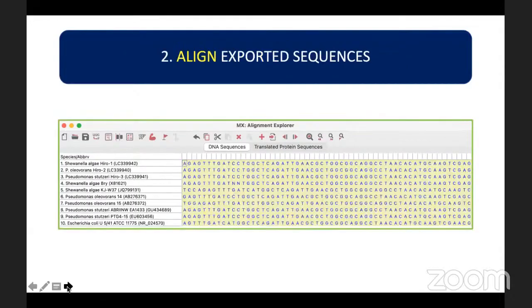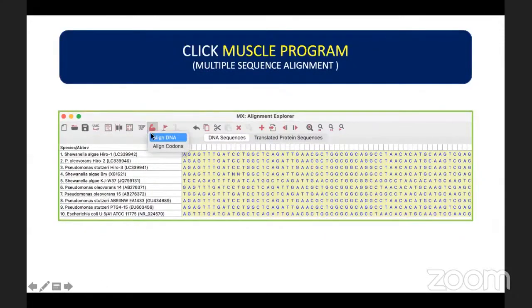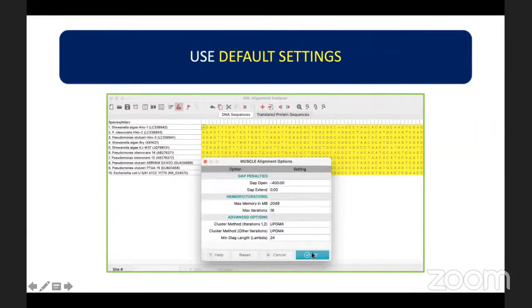The second step is to align all the exported sequences. You can select all the sequences — click any base and use Ctrl+A to select all the bases. After highlighting all the bases, click the MUSCLE program and Align DNA, and use the default settings. Click OK and it will start to align the data.